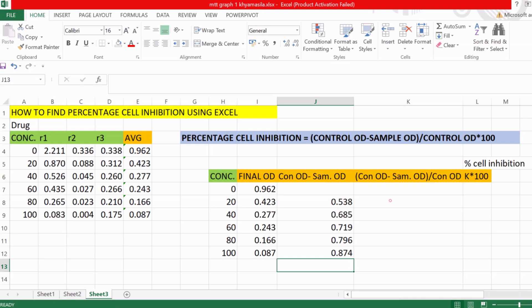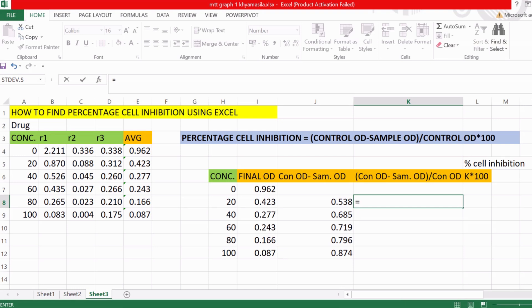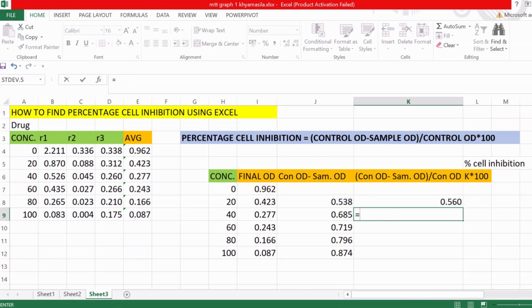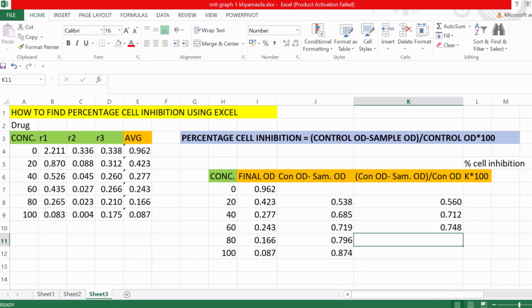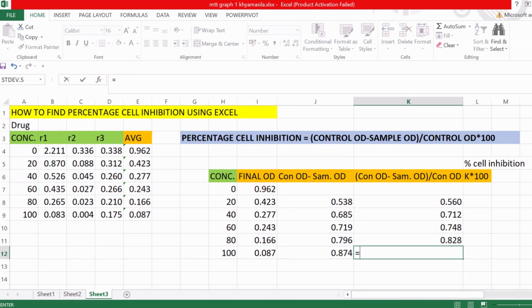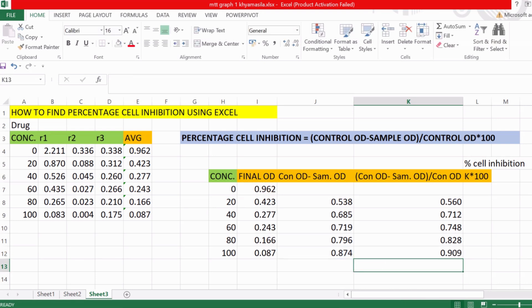In the second column, we divide the previous result by ctrl OD. So: equal to, select the ctrl OD minus sample OD cell, divided by the ctrl OD cell, then press Enter. Do this for all concentrations to get the values in the second column.